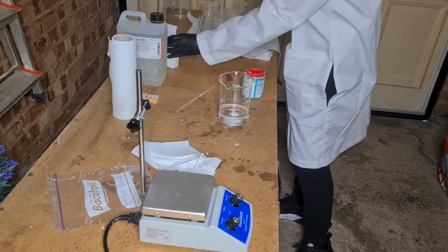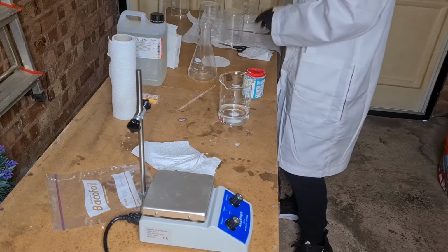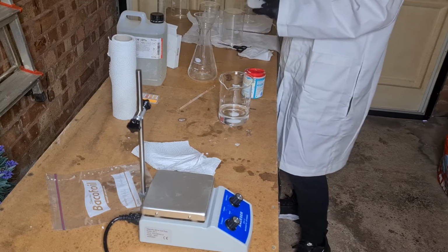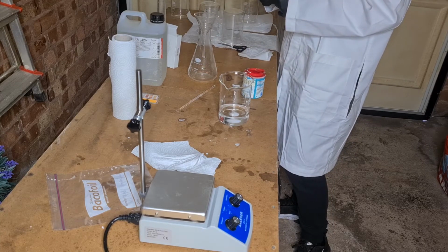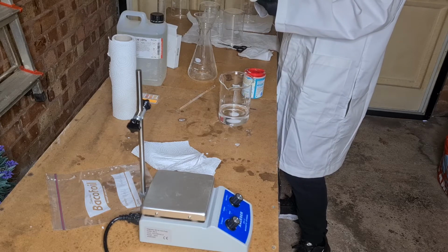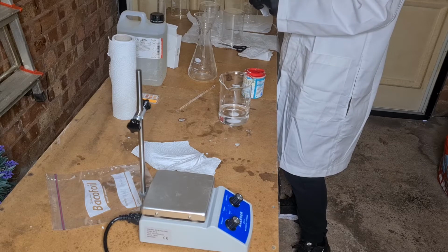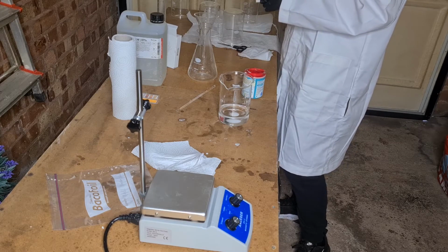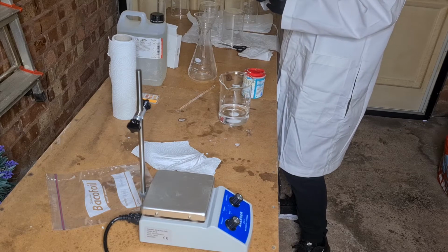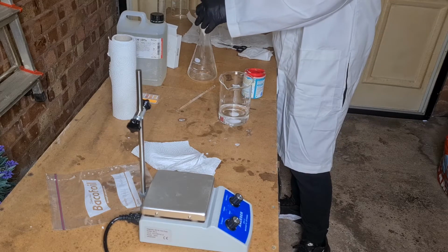Well done me. Right, so what we're going to do next is stick a funnel in here, fold the filter paper into quarters, like so. Probably quicker, but less precise. And then we're just going to take one of the little divisions in here. We're going to open it out. We're going to make sure it's folded down properly as well. And then pop it in here.